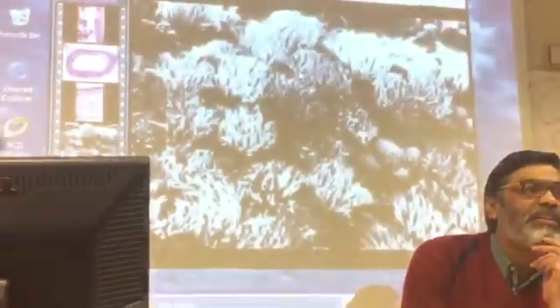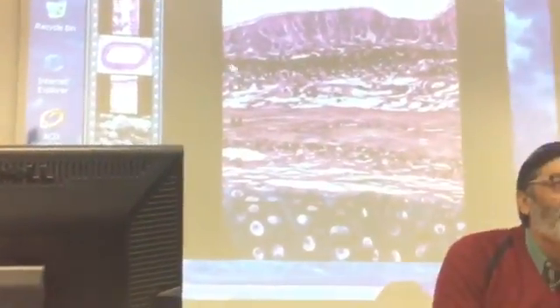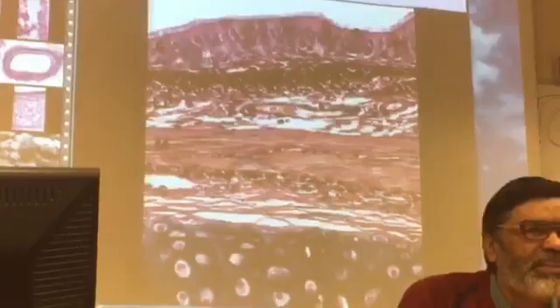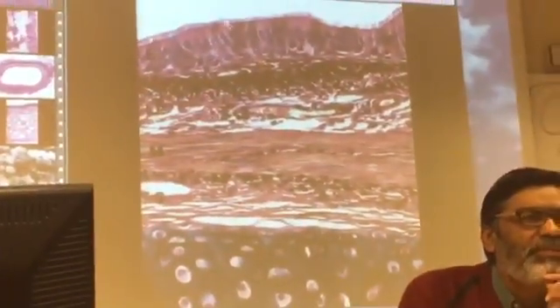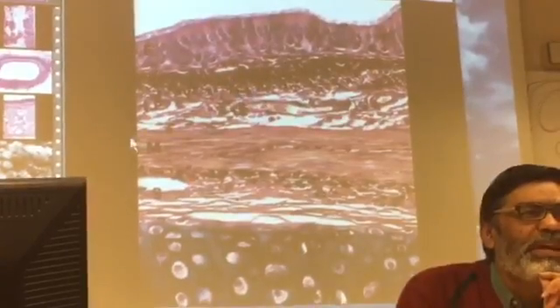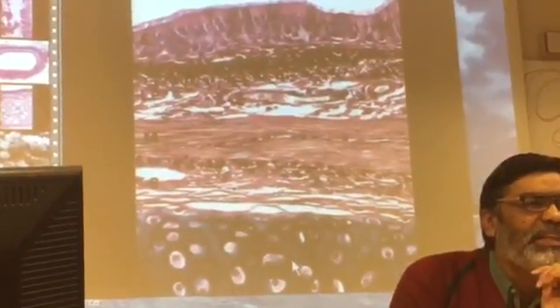This is a picture showing you one cell, and on the surface of the cells you can see cilia. Cilia are present. Another picture: this is a picture of the bronchus, but the structure is almost the same. Pseudo-stratified columnar ciliated epithelial cells, and then you can see the lamina propria, and then the muscle is present. And you can see cartilage here.